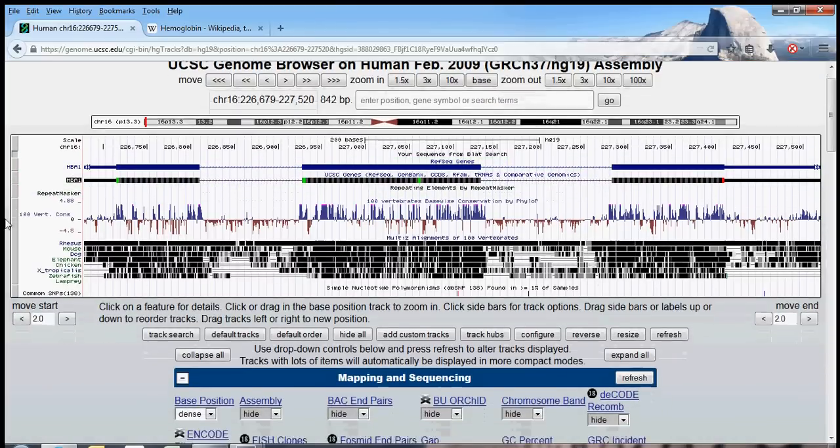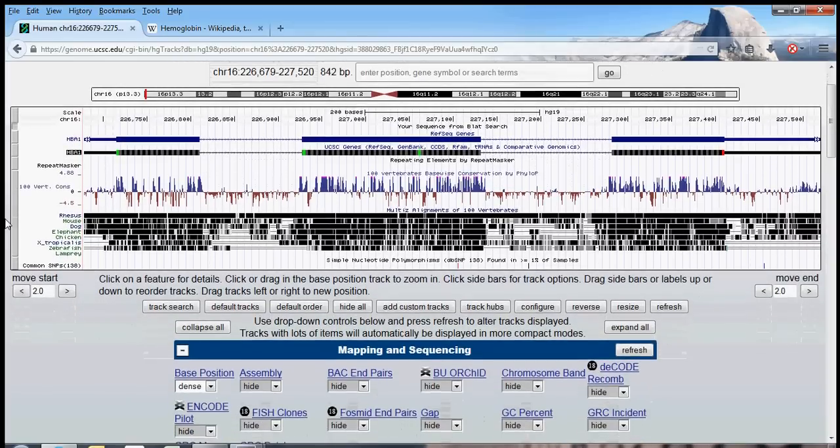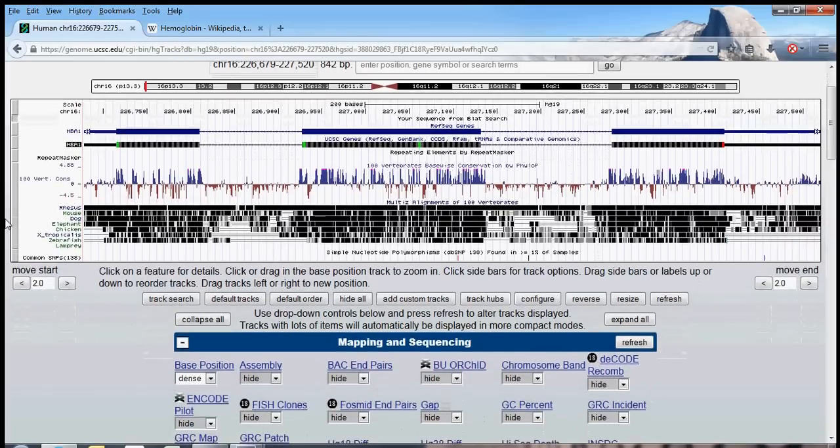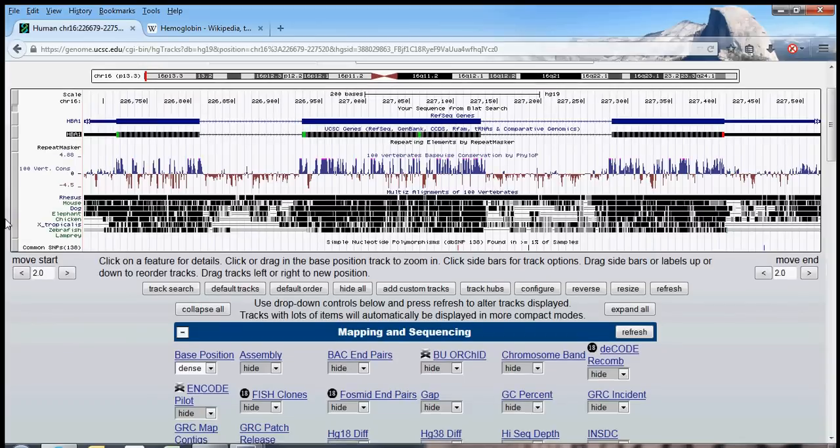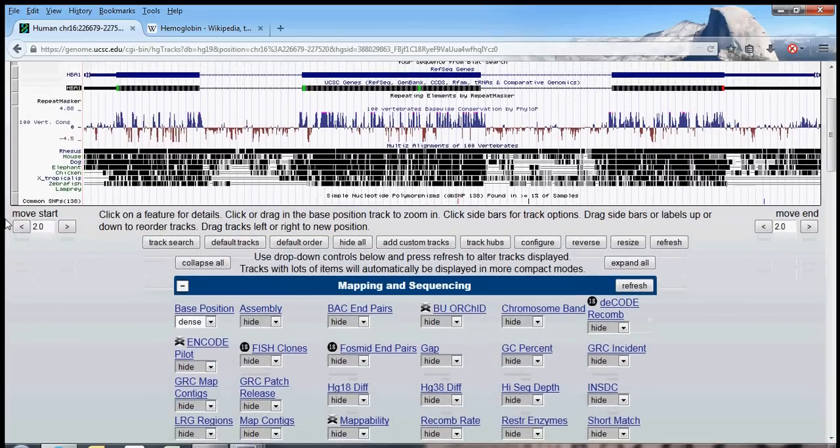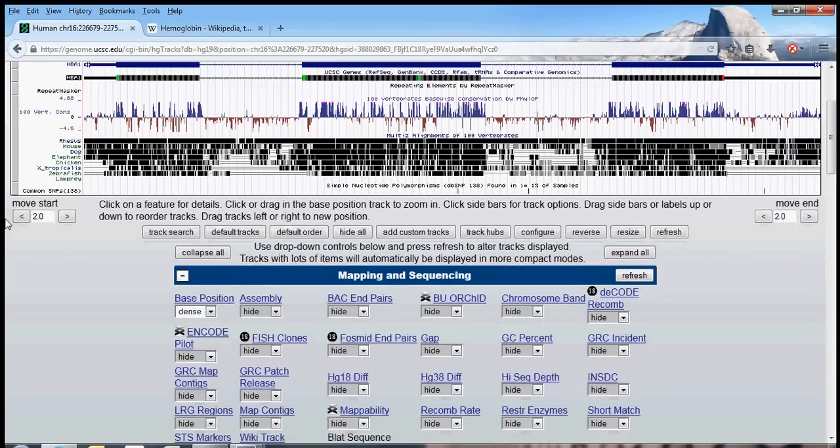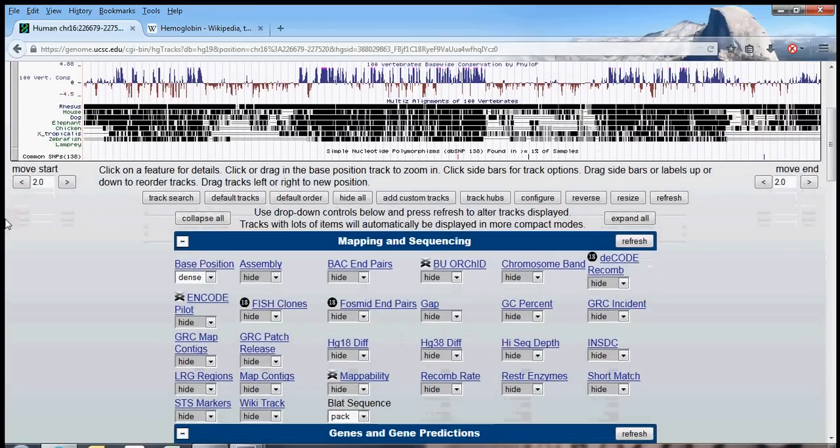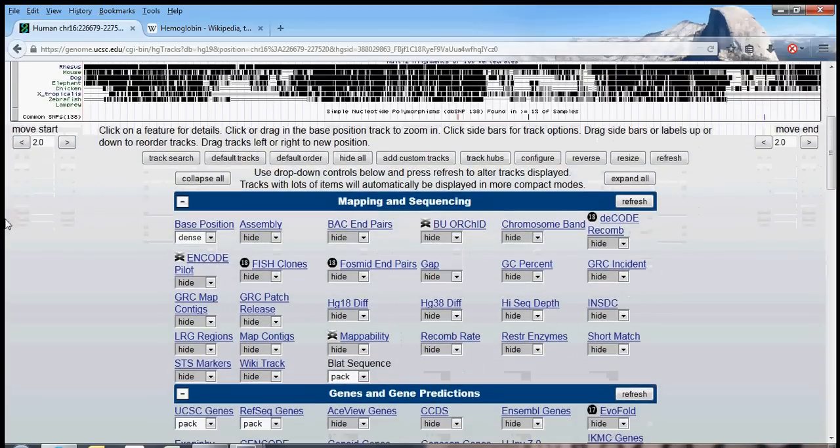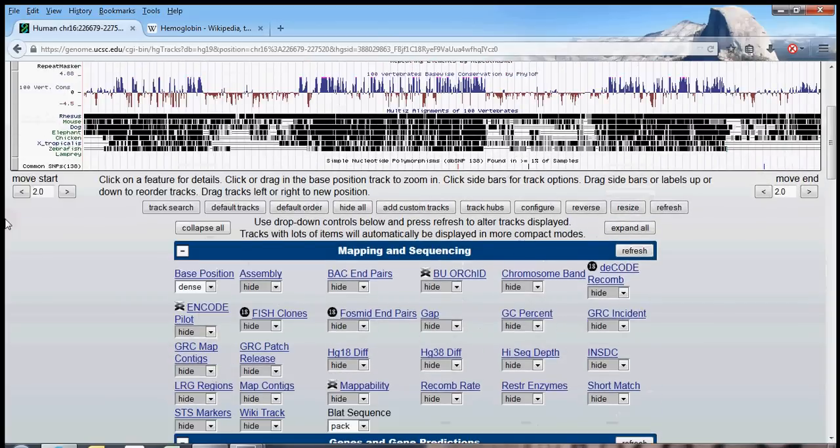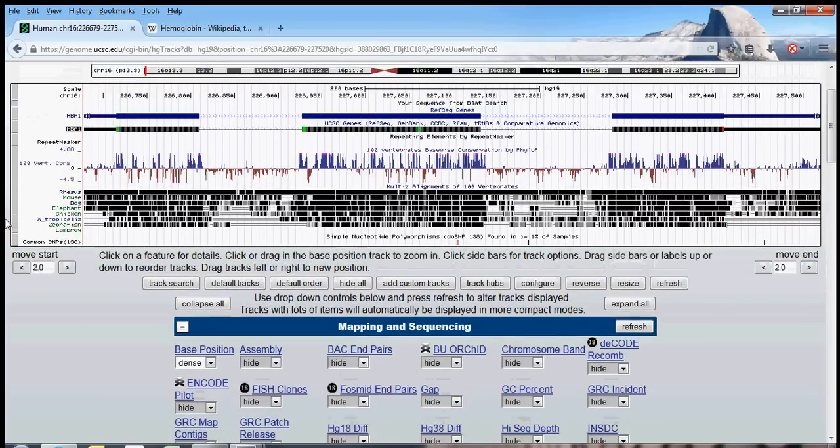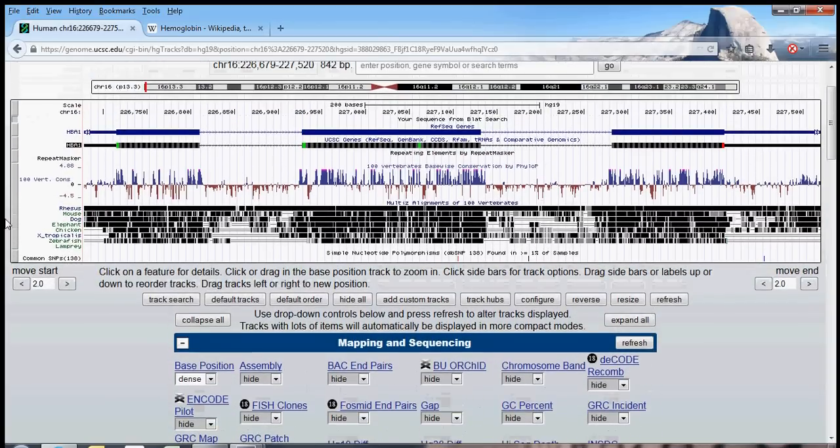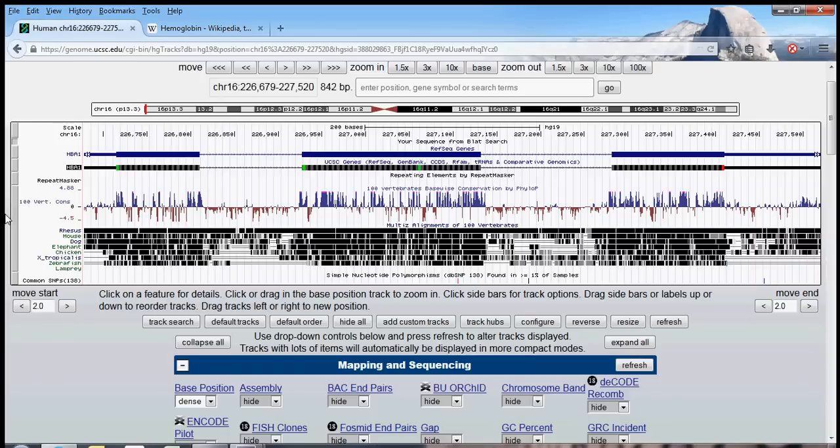Scrolling down, we see that the genome browser offers a truly enormous amount of information. And it's really much, it's too much to cover right now. And honestly, it can look overwhelming. But, in the coming tutorials, we're going to get comfortable with all of this information, and all the amazing things you can do with this research tool.